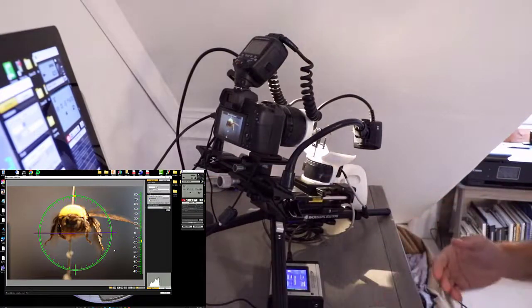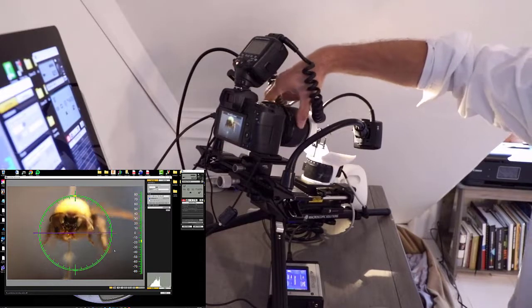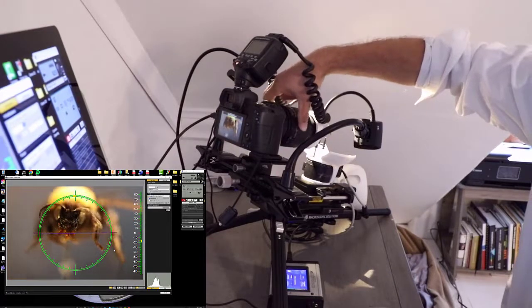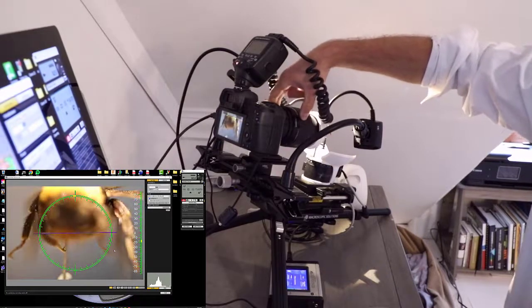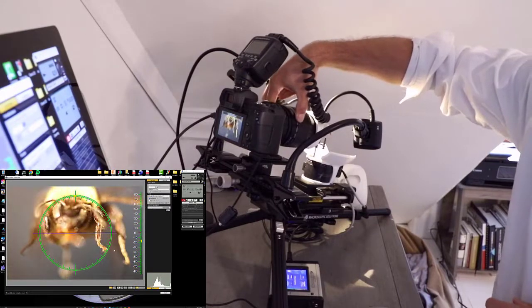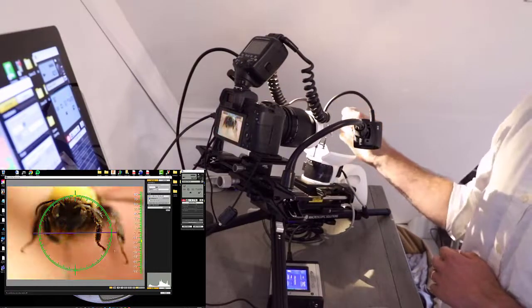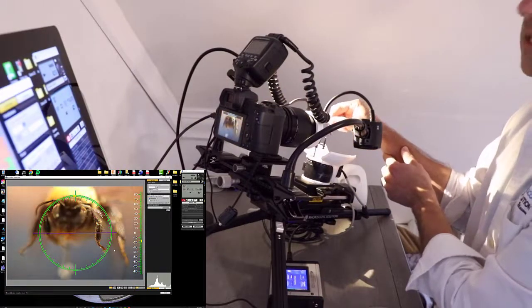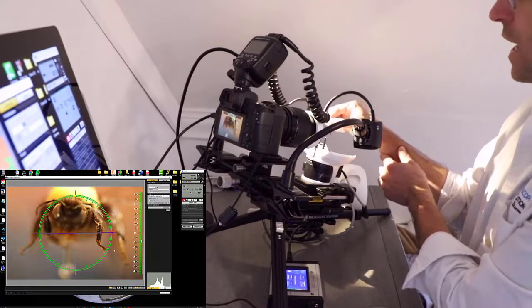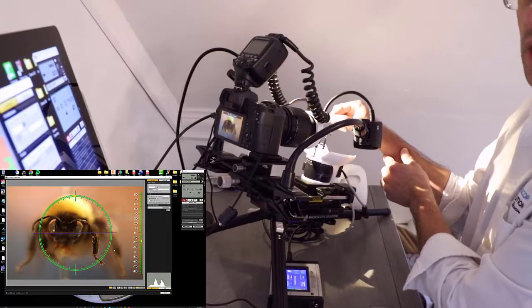And for something like this where we're trying to contrast something that's really dark, what we're going to do, I think, is really just sort of focus on a headshot here. Now, this is a museum specimen. It's been in collections for a long time, so you're going to notice it's not exactly a fresh specimen. There's going to be dust on the specimen, and I'll show everyone how we can go about cleaning that up using Photoshop.